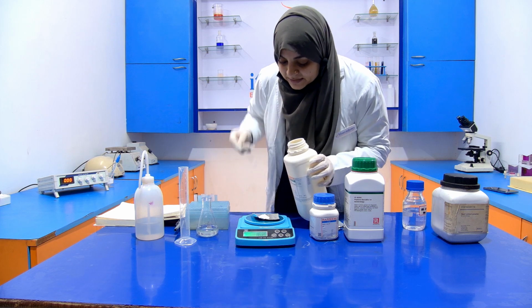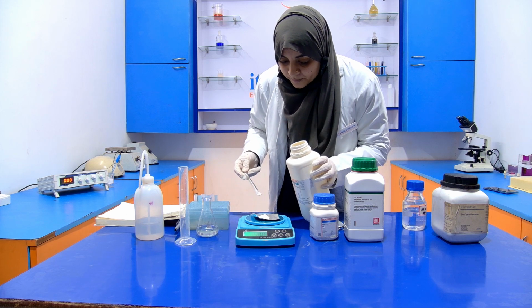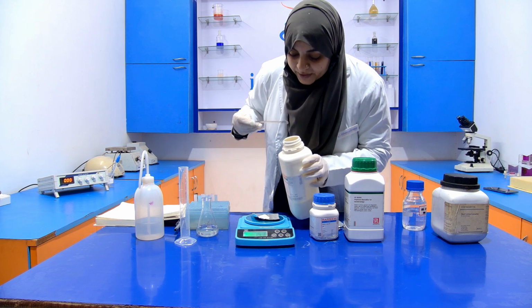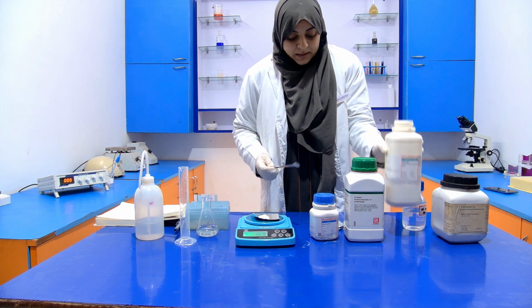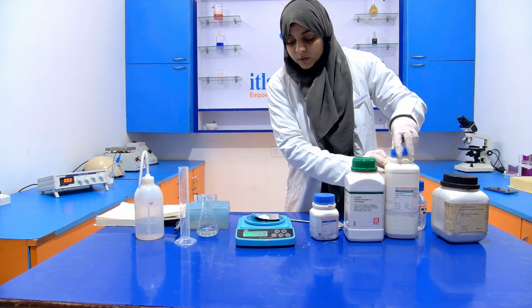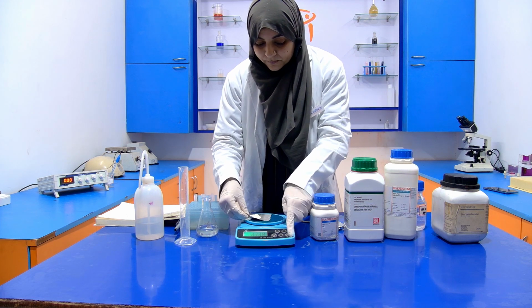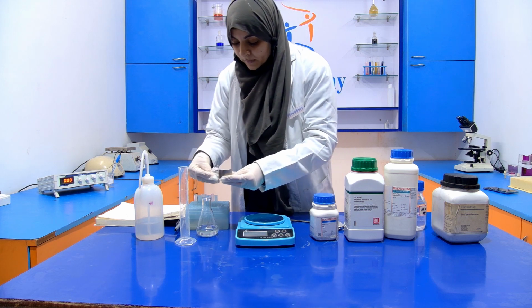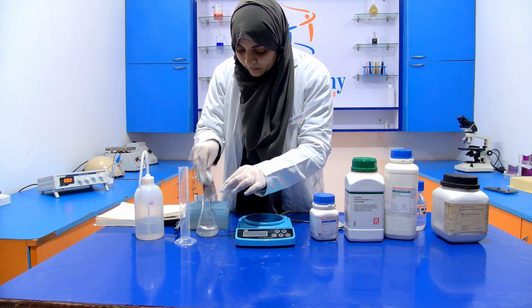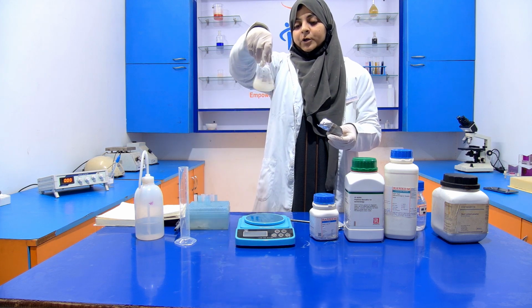Now it is 1.6. Again, we have to reduce the amount of agar. Now it is 1.51. Now this 1.52 gram of agar will be dissolved into the distilled water. Now dissolve the agar into the distilled water.